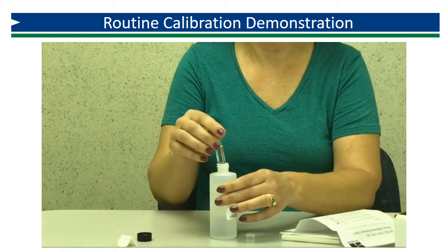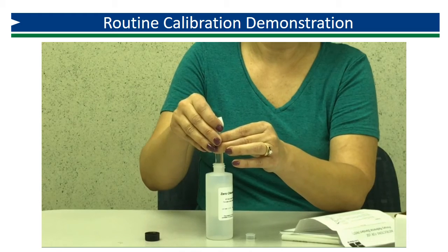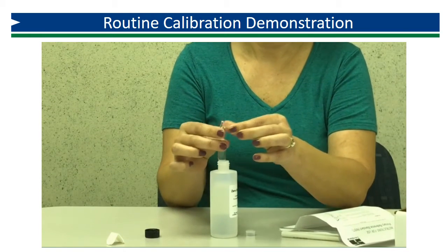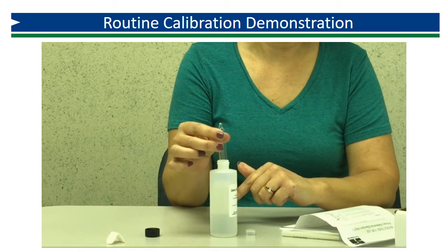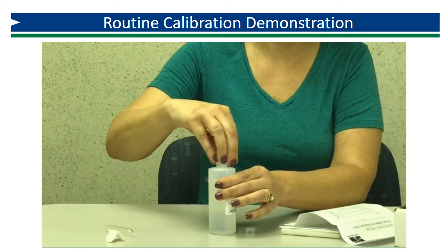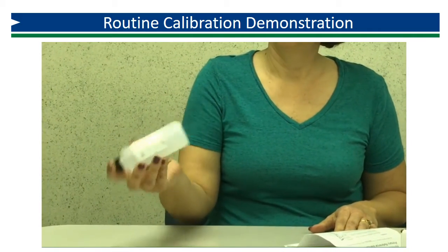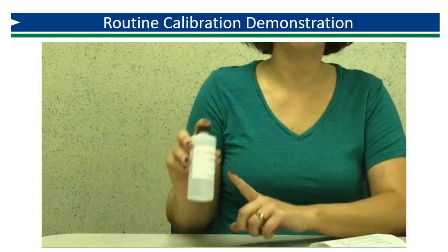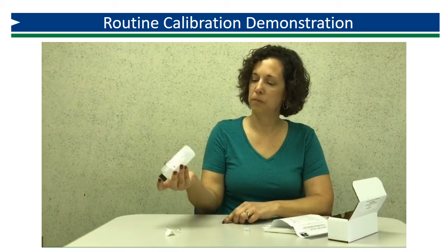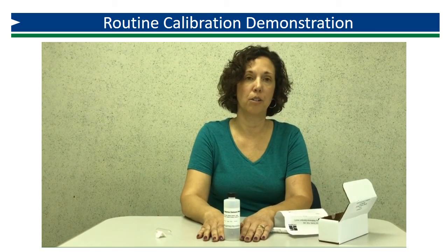Once the ampoule is over the top of the sample, break the other tip and tap it against the neck to get all of the standard into your water. Securely cap it and invert to mix — do not shake it. The concentration of your diluted solution is 1.50 mg/L. Now your sample is mixed and you're ready to analyze for free chlorine.